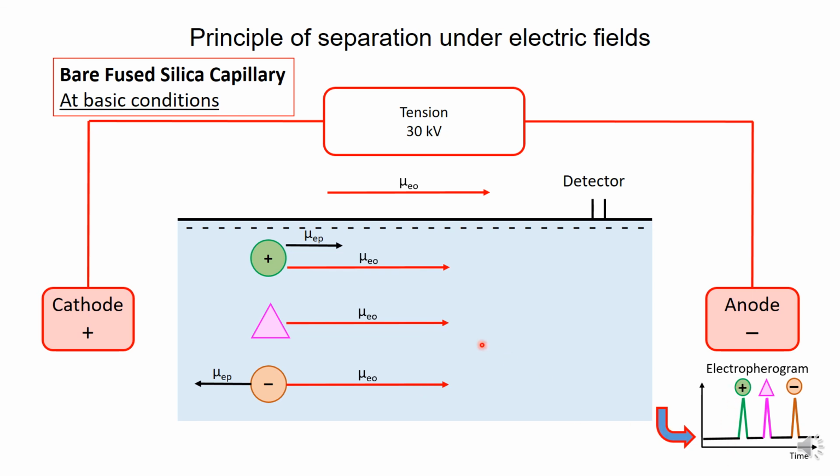And you have, in that case, first the cation, I'm sorry, second the neutral compound, and third the anionic compound. It is not possible to have a neutral one, a cation one, an anion, plus a neutral, etc. You have always the same order. So first the cation, second the neutral compound, and third the anion compound.